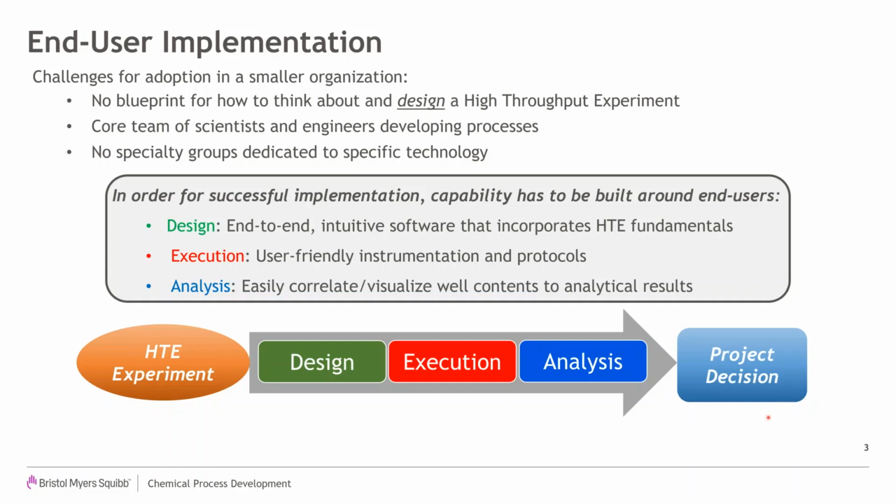So in building this capability, we realized that design had to be ultimately intuitive software, and hopefully one piece of kind of an end-to-end design and analysis software that incorporates our HTE fundamentals. On the execution side, because we don't have any specialty groups that are dedicated to instrumentation, we realized that user-friendly protocols and instrumentation that are easy to use would have to be implemented. And then finally, to make it all fit, the analysis has to easily correlate what went into the design with what happened on the analysis side to make it easily readable and understandable.